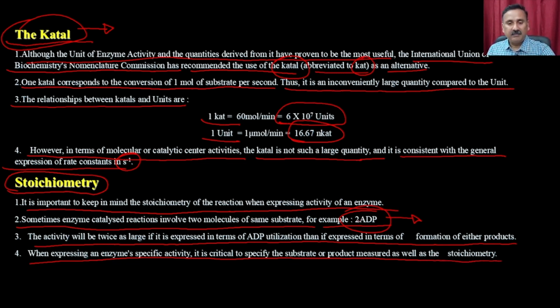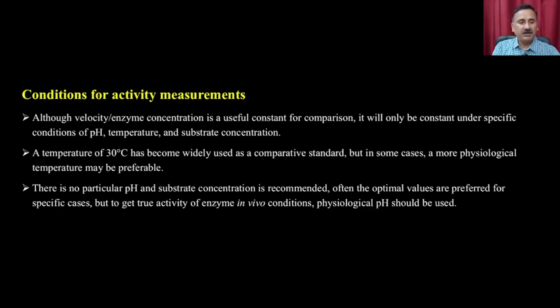Now, there are multiple conditions you have to consider before you design an enzyme assay and use it for measuring the activity. So, conditions for the activity measurements.